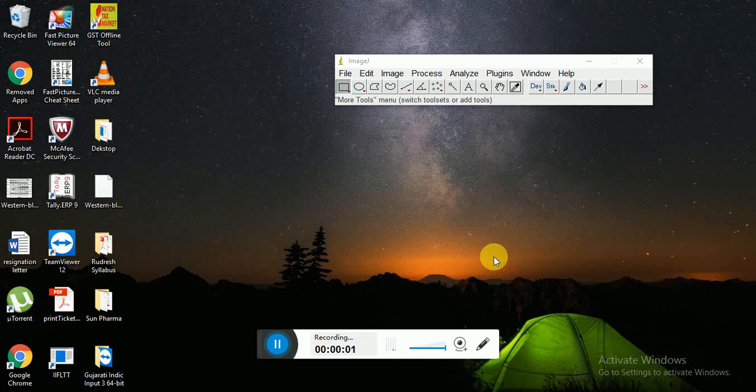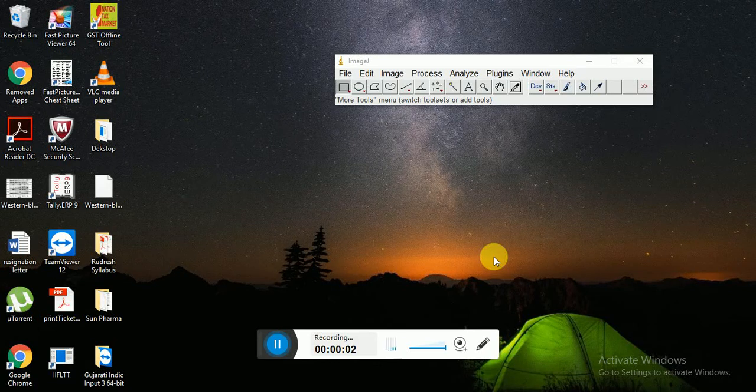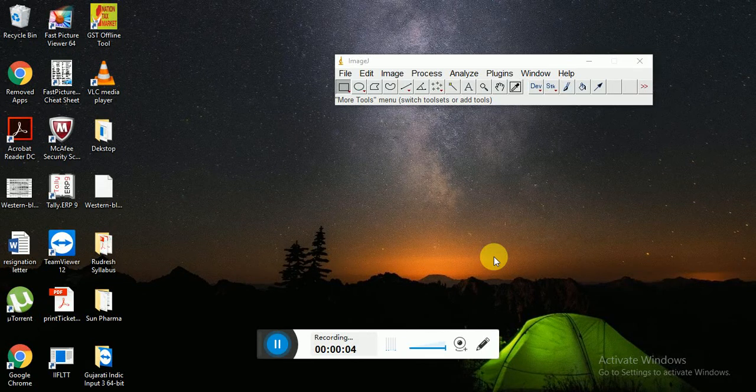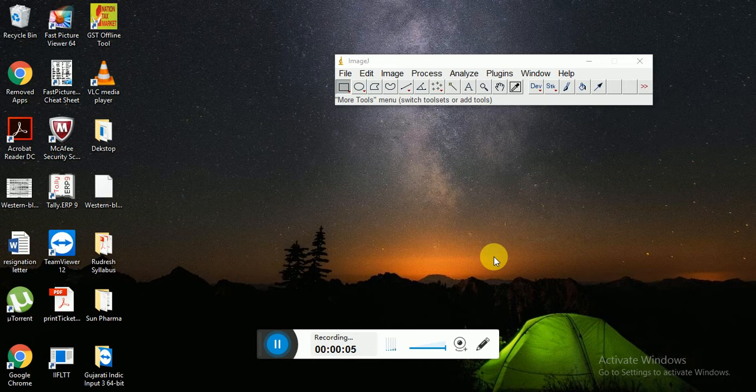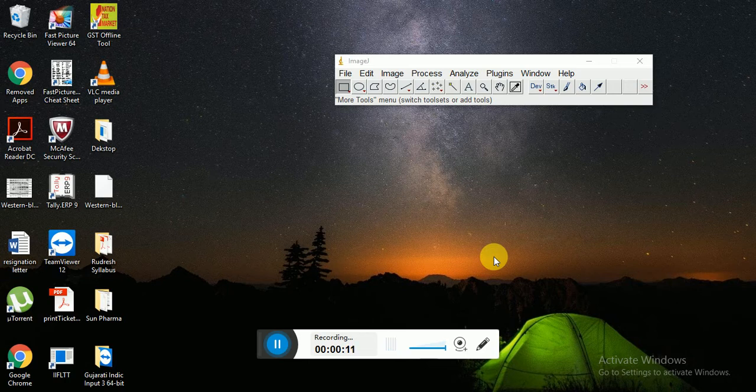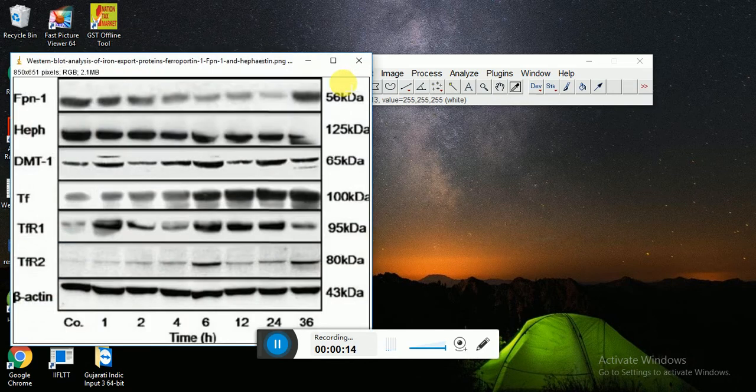Hi, today I am going to show you how to calculate protein concentration and ratio by image using a very simple technique. First load an image to ImageJ.